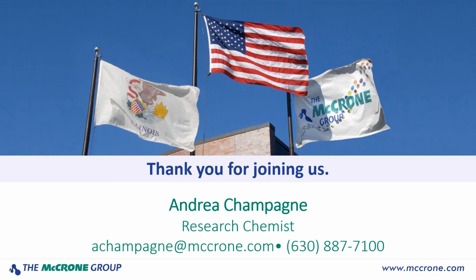Anybody else have any questions that you would like Andrea to answer? Here's another one from Anne. Are you performing the picking? Sometimes, yes. The clean room is much better at it than I am, but we do see a variety. I am able to do some of my own preparation work, so I will spend about half my day with my face in a stereo microscope doing particle preparation, picking, including any of the rinsing necessary. Filtration has to be done in our clean room, though.